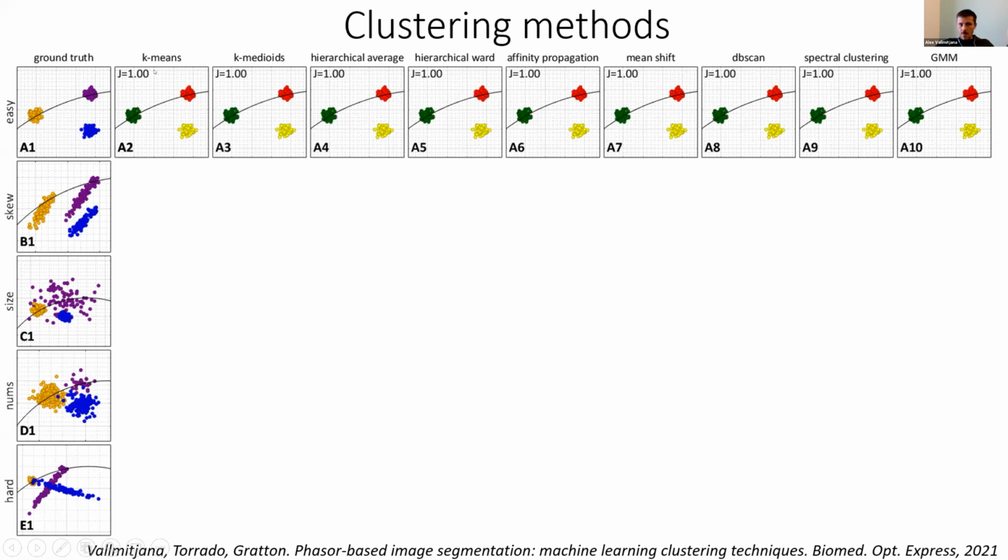So you may have heard of K-means. K-means is probably the most well-known of the clustering methods. It is based on distances. So given a certain random grouping, you find the mean position of all the elements in that group and then measure the distance of all the elements to that center. So you basically want to minimize the distance to the center of the group while maximizing the distance among groups.